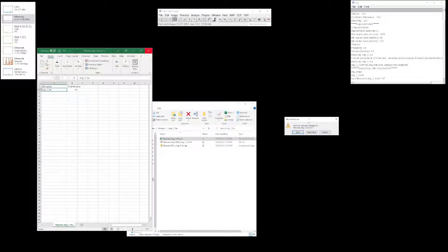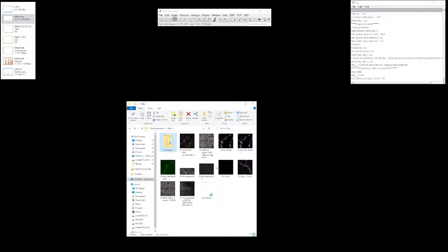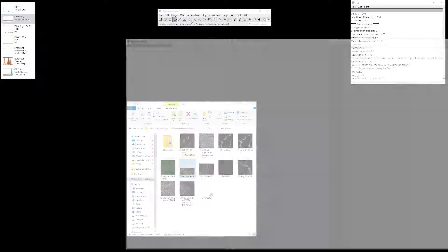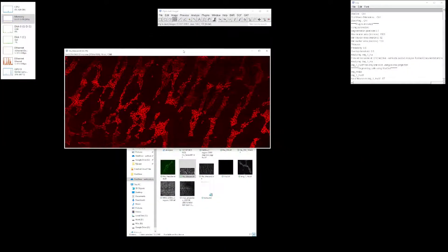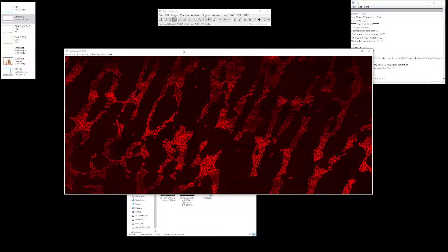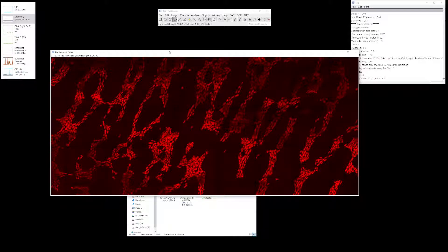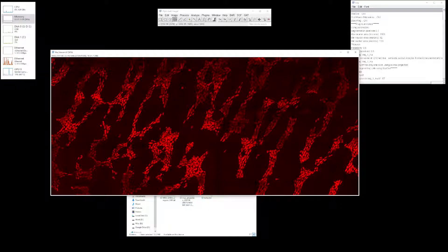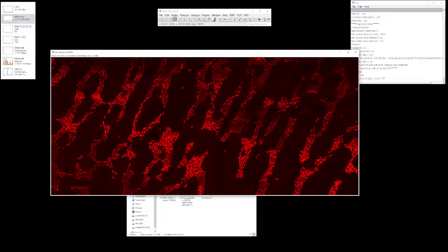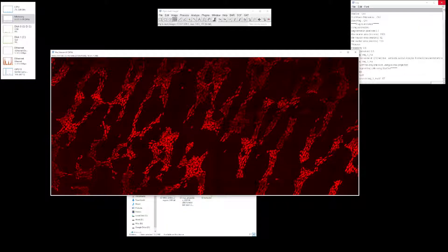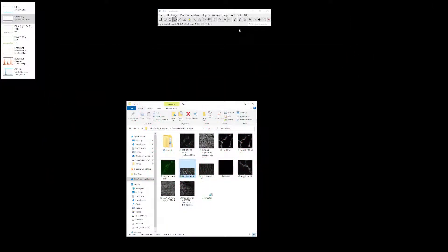If you want to analyze a big tile scan, the power here is that you can analyze really large images quickly. I'll show you this particular tile scan. This was acquired at 40x objective, maybe 20x. We took a tile scan from mouse tissue where the enteric neurons are labeled with Hue. There's probably around 1,000 to 2,000 cells here, and this is one of those cases where you don't want to manually label or count these. In order to do this, we can use Gut Analysis Toolbox.